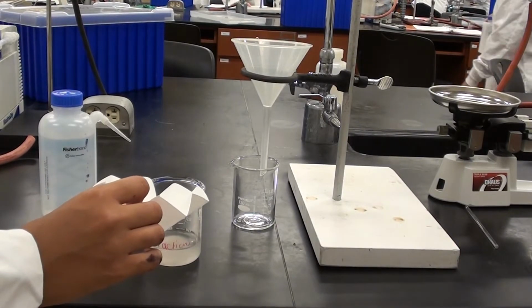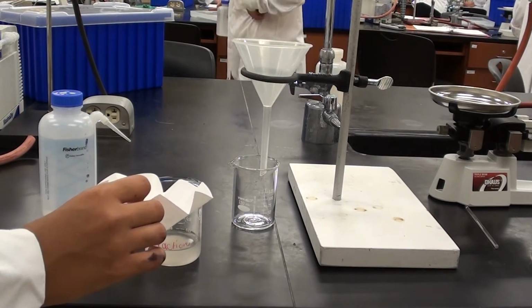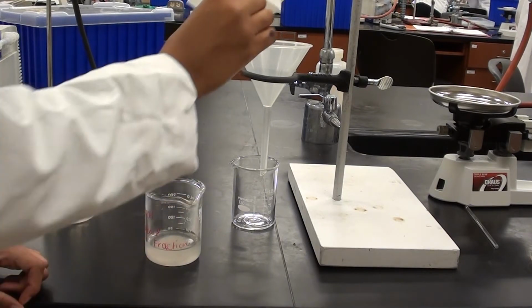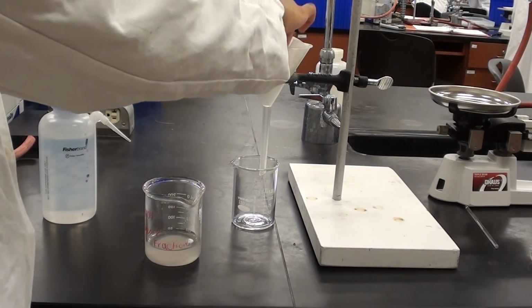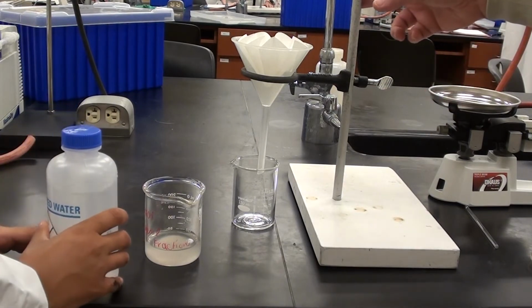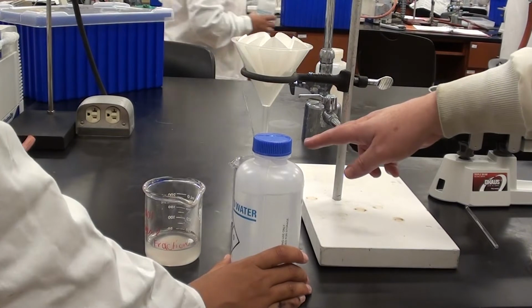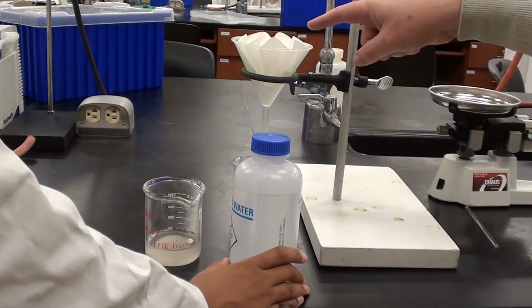Alright, now we're at this filtration step, and Sabrine is going to go ahead and filter the solution. So go ahead and put the filter paper in the funnel, please. Now before she gets started, we'll just point out what we've got here. We've got a filter funnel and a ring against the ring stand, and we've got an empty beaker under here to collect the stuff that comes through. We're not really interested in what's coming through here, we're really interested in the sand.